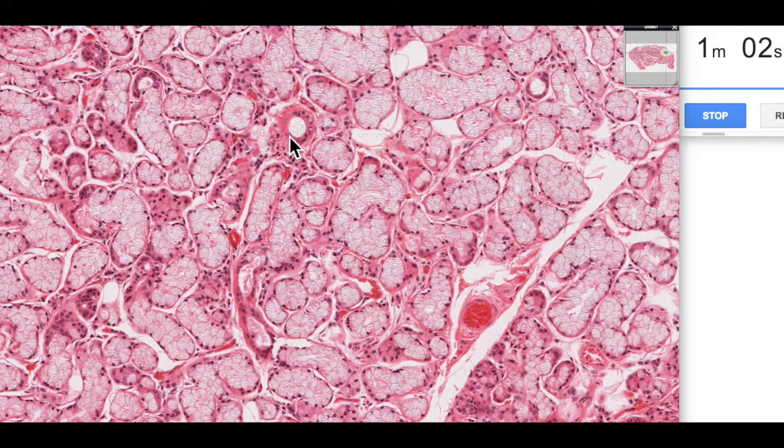We can see a duct here. So here's an intralobular duct. Here's another little one over here. So they move from a simple cuboidal to a tall simple cuboidal, and then eventually they may form a striated duct.